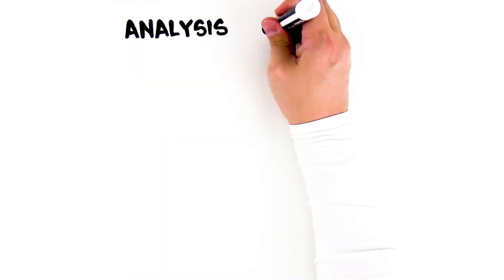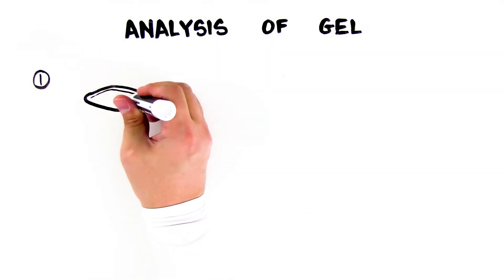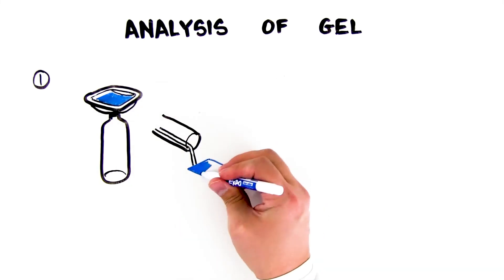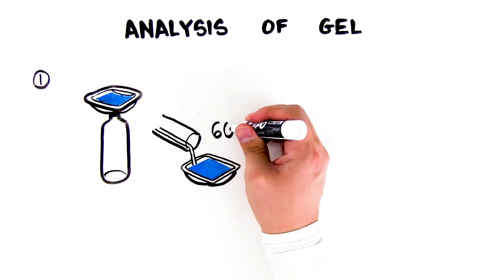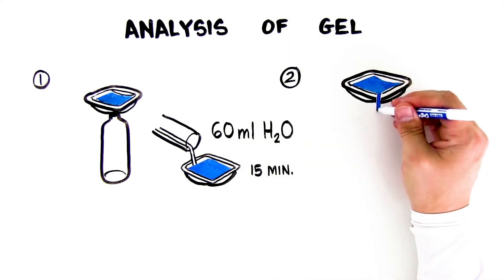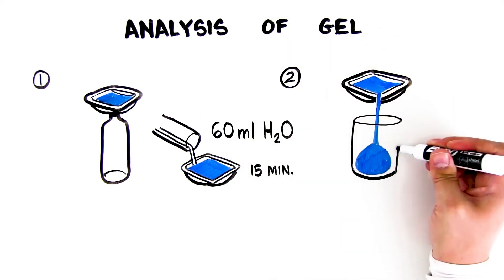Day 3. Analysis of the gel. First, pour off the DNA stain into a bottle. Add 60 milliliters of water to the gel and let the gel de-stain 15 minutes. Second, pour off the water into a waste beaker. Analyze the results with the help of your teacher.